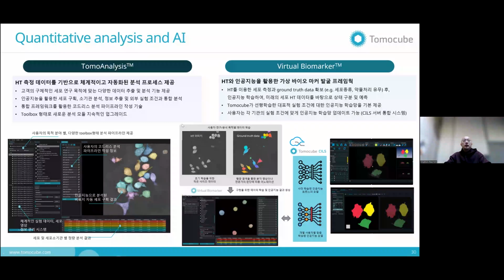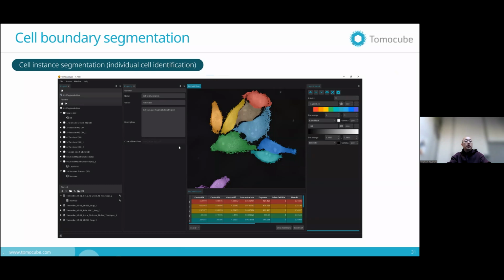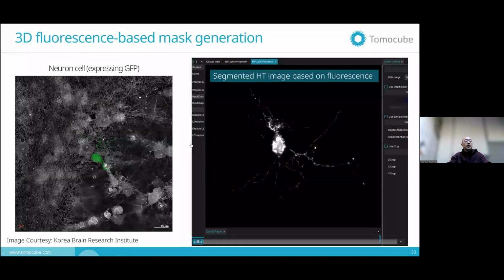We are also developing various advanced cell imaging features, which are not commercially available yet, but we have a platform to integrate the newly developed AI-based cell analysis, which will follow in a few months' time frame. So I will also talk about some ongoing developments in the context of AI analysis. I'll just skip this part.